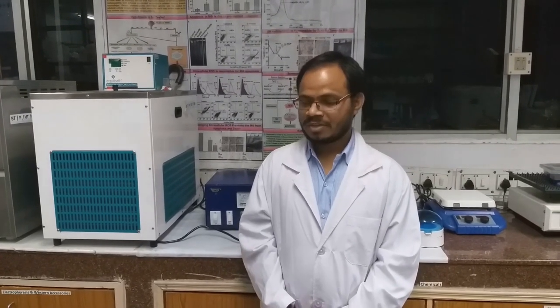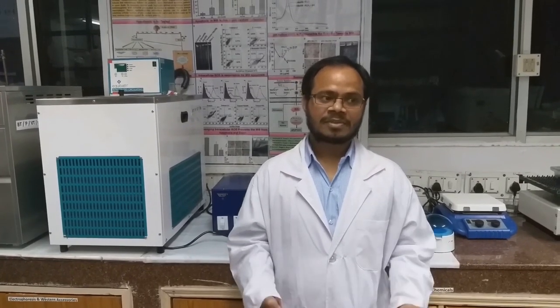Like, all the time you have to keep polymerase enzymes and your primers on ice. And another thing we have to remember is, while running the agarose gel electrophoresis, always wear gloves to prevent any contamination with the ethidium bromide.